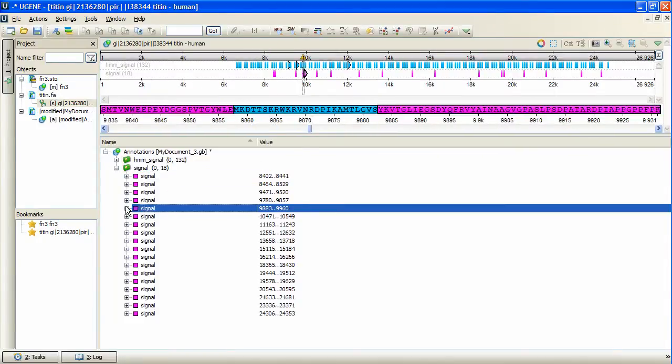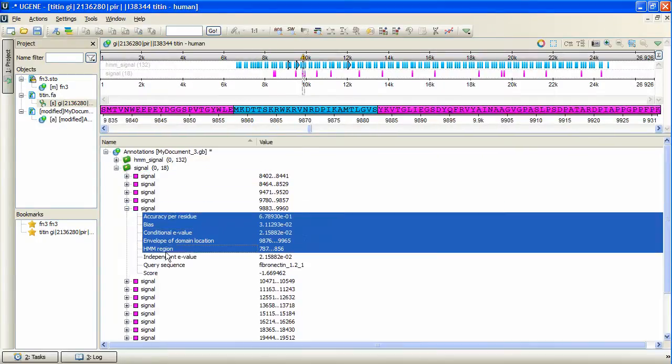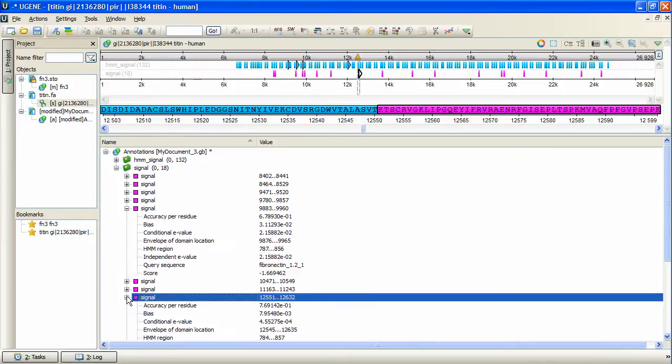We can browse the annotations and read the search results parameter values. That's how HMMER3 works with Ugene.